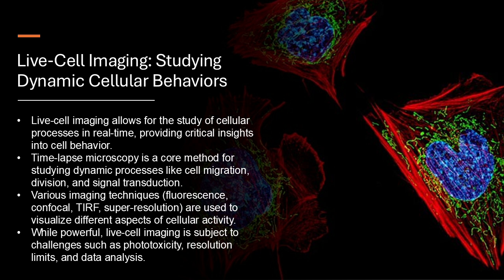And what are we learning from watching this cellular dance up close? Well, we're gaining a much deeper understanding of the control mechanisms that ensure accurate cell division, which is essential for growth, development, and tissue repair. We're also learning what happens when these controls go wrong, which can lead to diseases like cancer. So by watching cells divide, we can potentially identify new targets for cancer therapies. That's the hope. And there's another critical area where live cell imaging is shining a light.